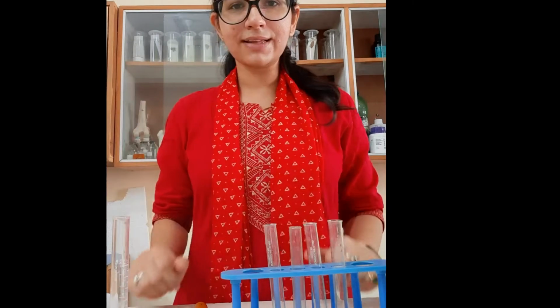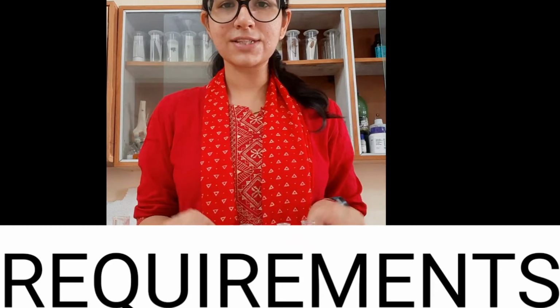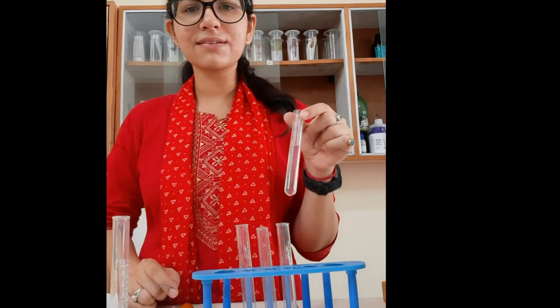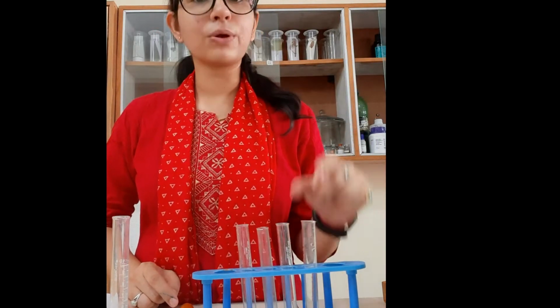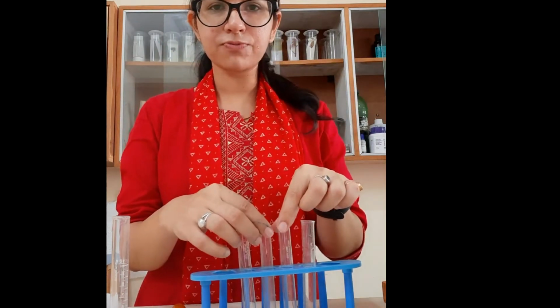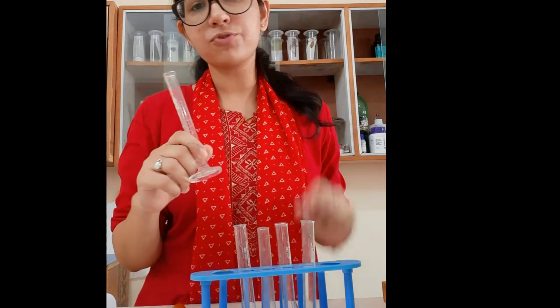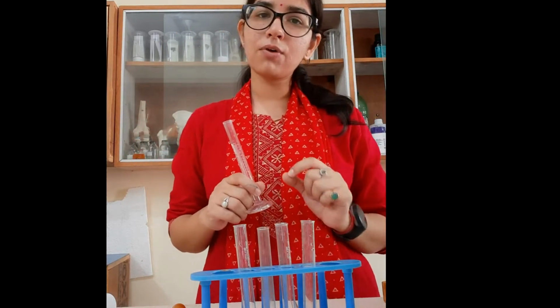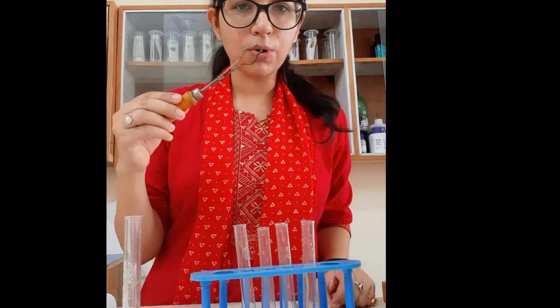So let's look quickly at what our requirements are for today's experiment. As you can see, there is the test tube stand, and I have these 4 test tubes. This is our today's sample, because we have to find out sugar, glucose in our urine sample. So these are the tubes for our experiment. This is the measuring cylinder, because we have to very specifically put 2 ml of urine and 2 ml of Benedict's solution. So I am using the measuring cylinder. This is the test tube holder.